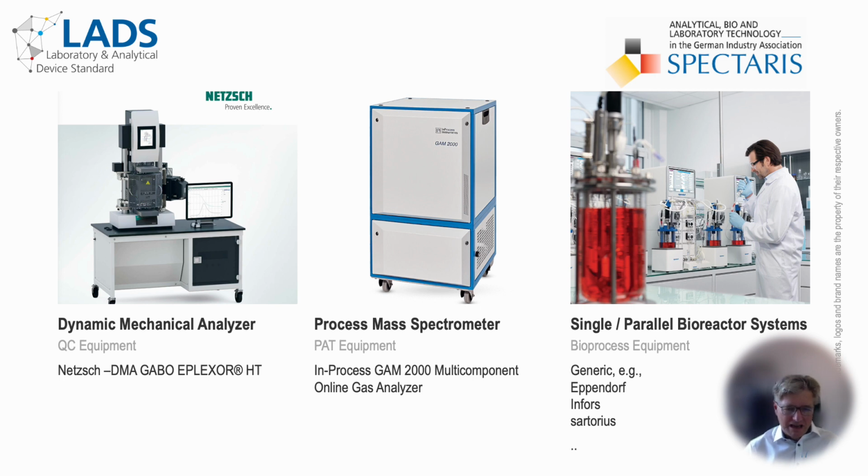Now let's consider two more candidates representing process equipment used in laboratories. Firstly, a process mass spectrometer as shown in the center image, and secondly, single or even parallel bioreactor systems as shown in the picture on the right. Given my personal background as co-founder and CTO of a company pioneering parallel small-scale bioreactor systems for most of my professional career, you can be assured that such equipment can be successfully modeled and implemented with LADS OPC UA as well.